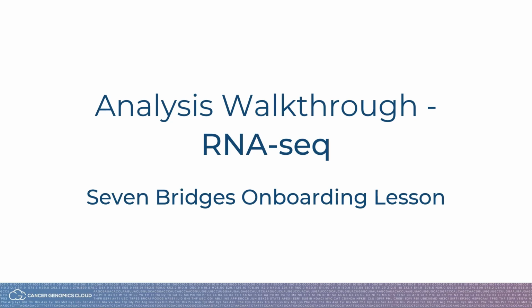Welcome to the Analysis Walkthrough RNA-Seq video, which is part of the Seven Bridges onboarding lesson for the Cancer Genomics Cloud.